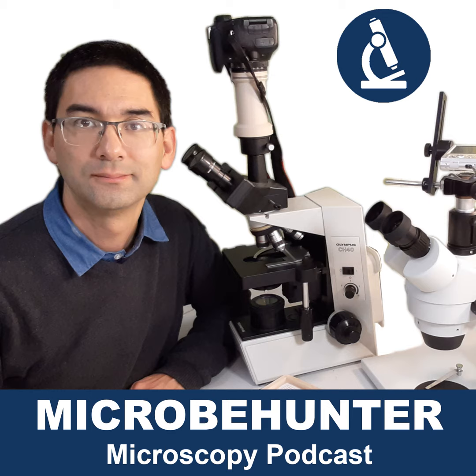This means that the bottom lens of the objective becomes covered with oil, and you do that so that there is no air between the lens of the objective and the microscope slide, because this increases brightness and resolution. These objectives are made in such a way that they're oil tight, so you can actually cover the bottom part in oil.